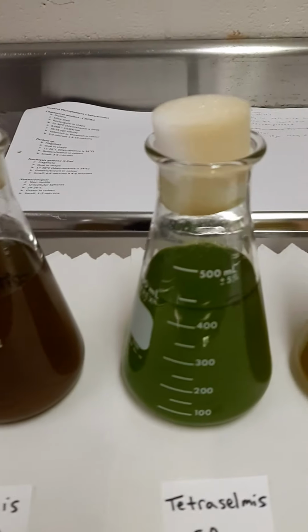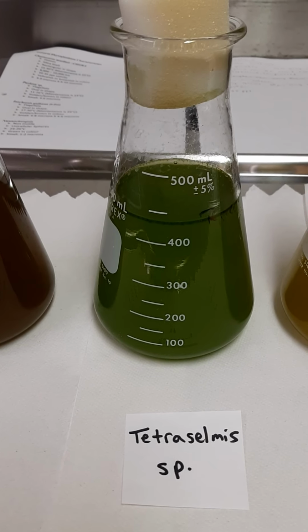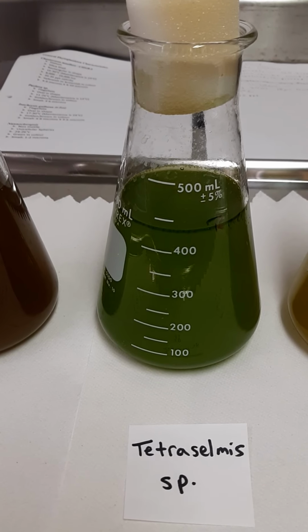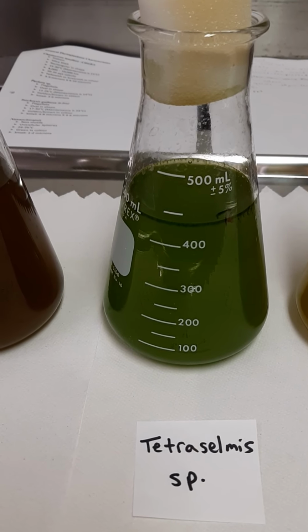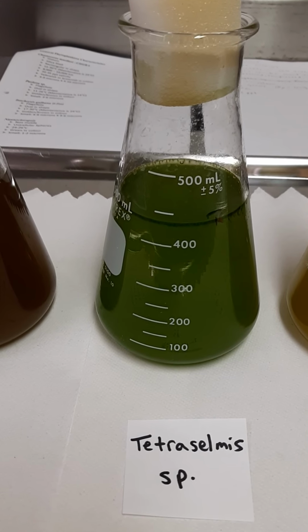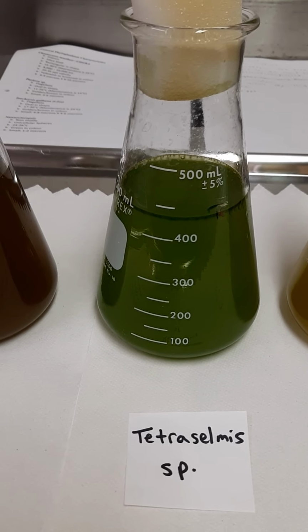The next algae would be your Tetraselmis, and it's a Tetraselmis species. It's green in color. It also is a flagellate. It varies greatly in cell size and cell shape. It can be round, ovoid, elliptical, compressed. It usually grows between 10 microns long by 14 microns wide, and it grows between 19 and 21 degrees Celsius at 20 to 35 parts per thousand.